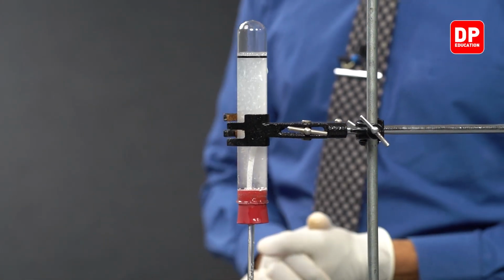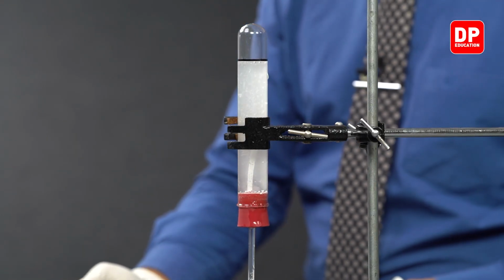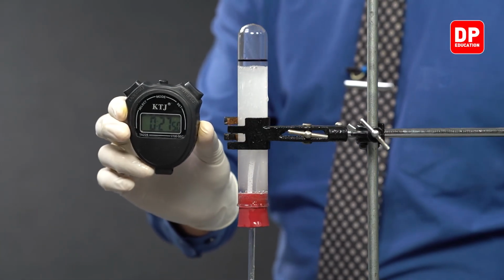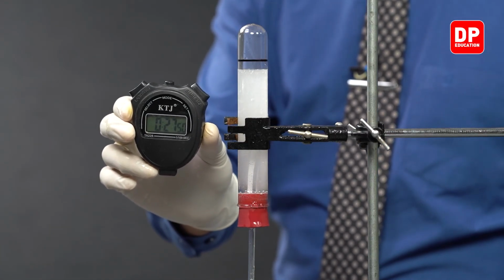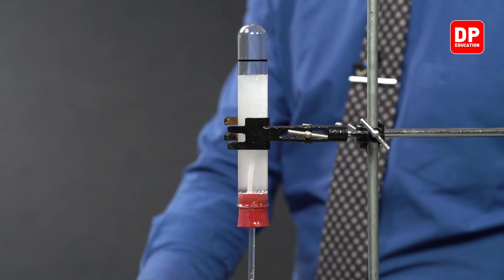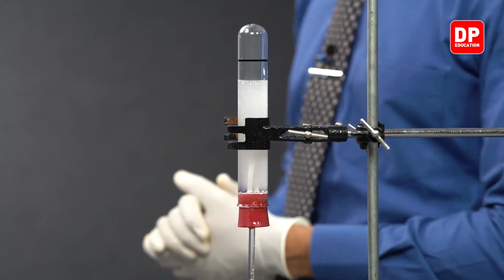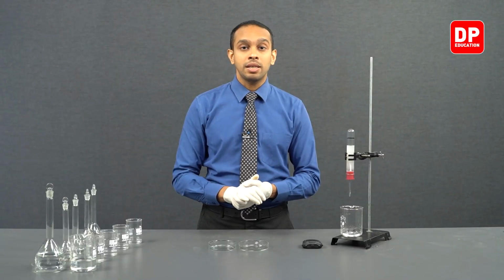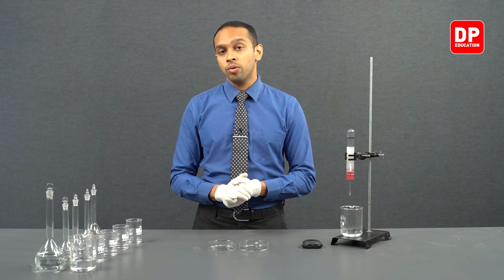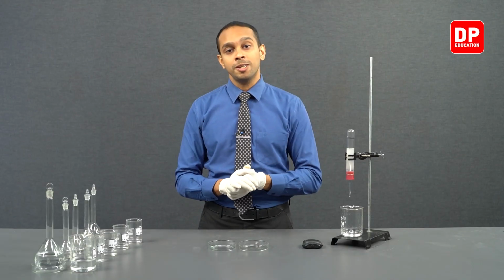As you can see students, the reaction is happening much faster, and within 27 seconds, we have collected the hydrogen gas all the way to the mark that we have made here. So it took exactly 27 seconds. So now we know how fast the reaction will proceed when we increase the concentration of HCl.